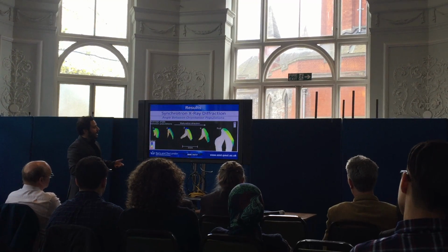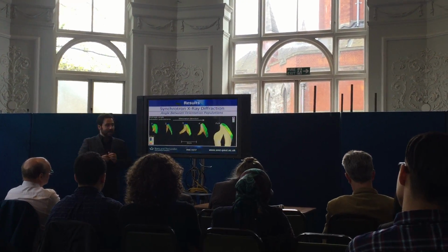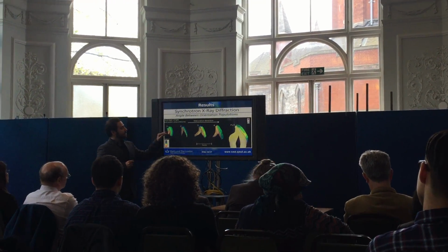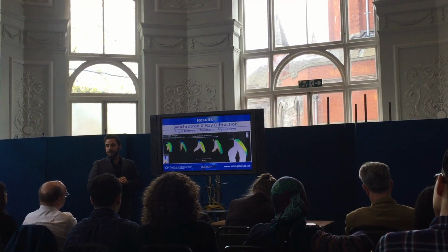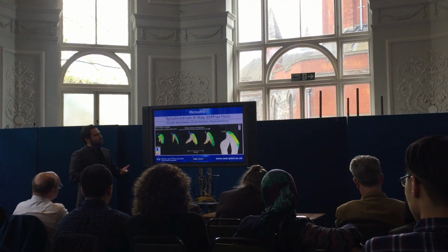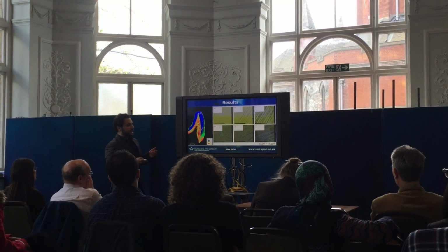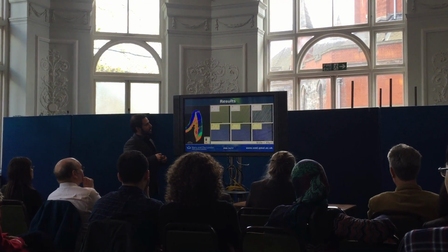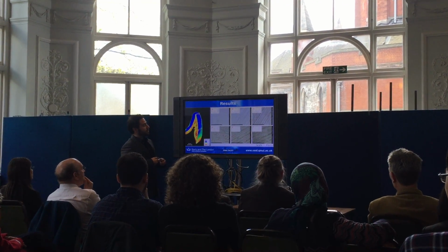I went on and I mapped the angular difference, and it was found that the angular difference is higher near the EDJ in all of my samples. Now, to make more sense of what we are seeing, I did some SEM analysis, and here you can see the 002 reflection curves that I talked about.